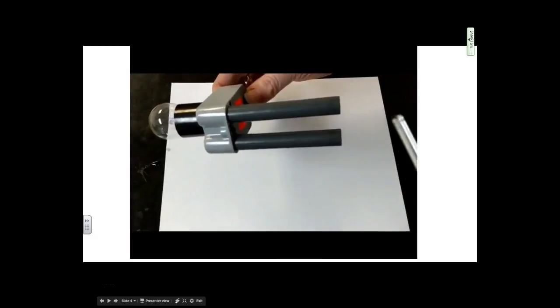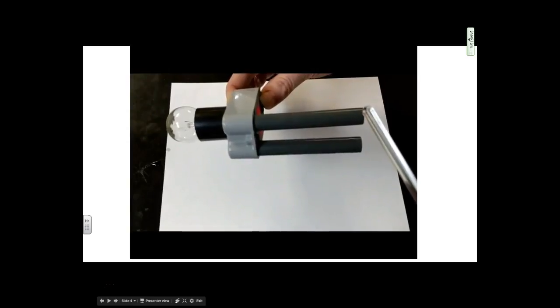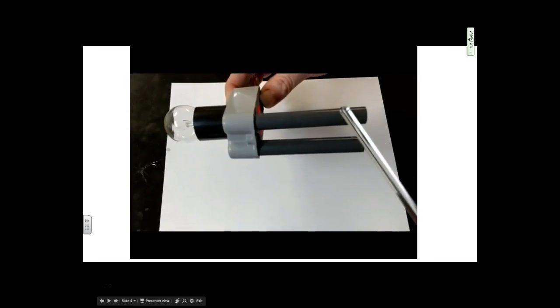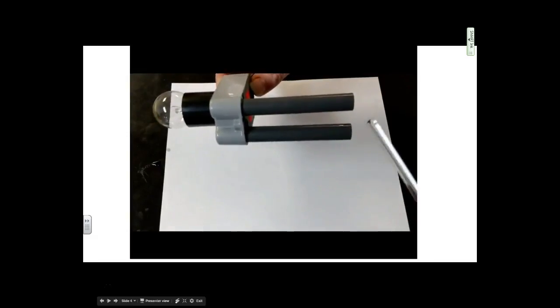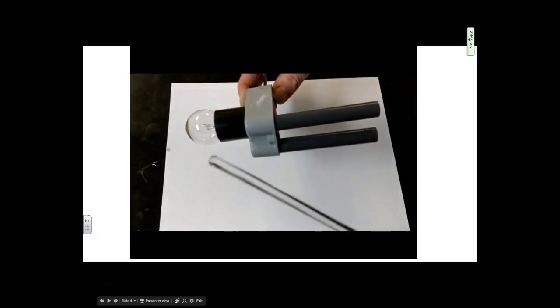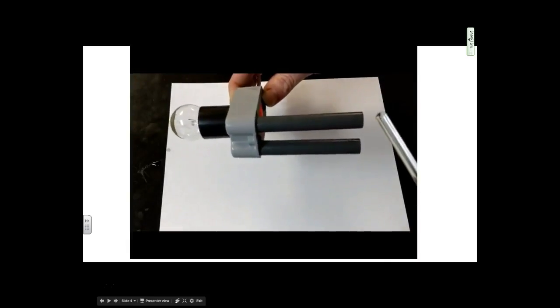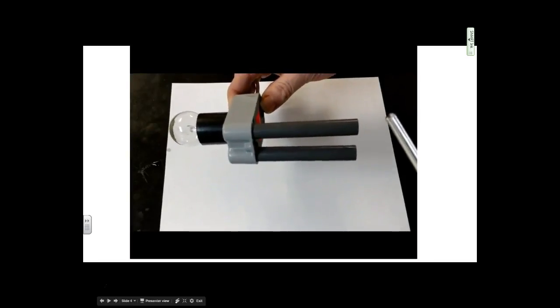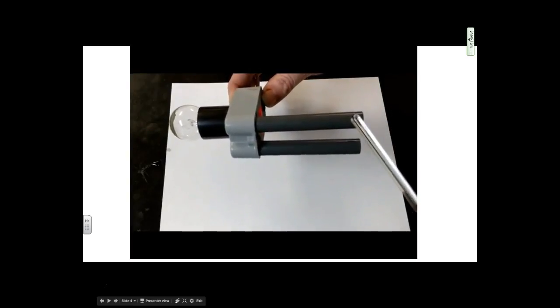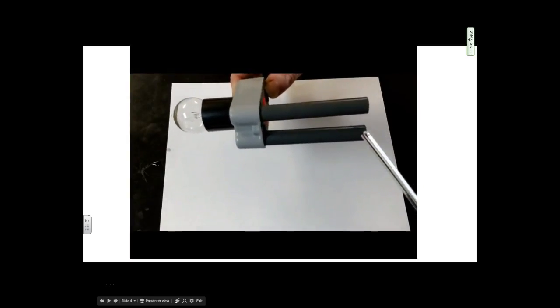Now, if we were to put this into a solution that had some ions in there, the ions, or those charged pieces, could move from one electrode to the other electrode and complete the circuit. When that happens, the light bulb will light up. If we put this in a solution that does not contain ions, there are no charged pieces to complete the circuit. So the light bulb will remain unlit because the circuit is not complete.